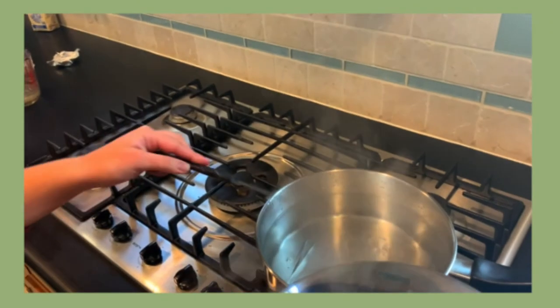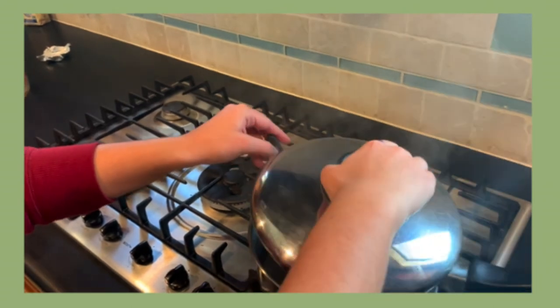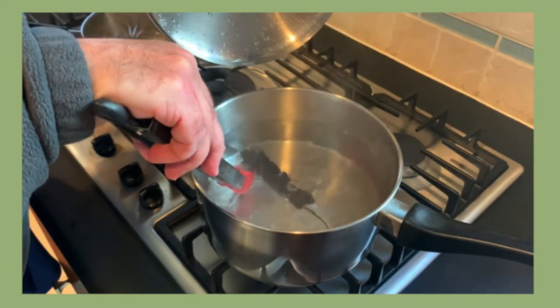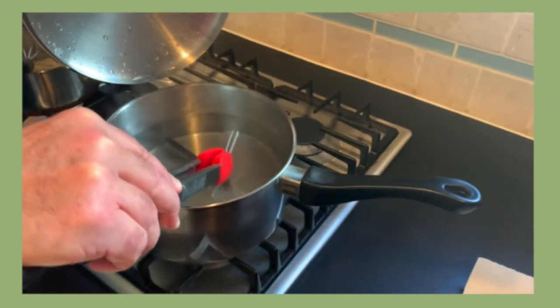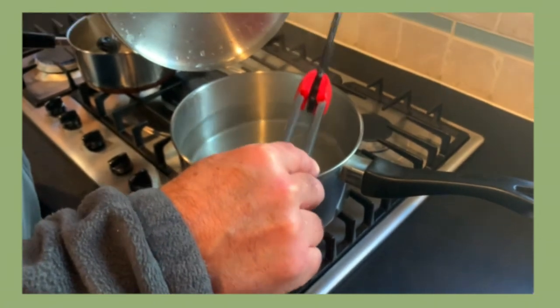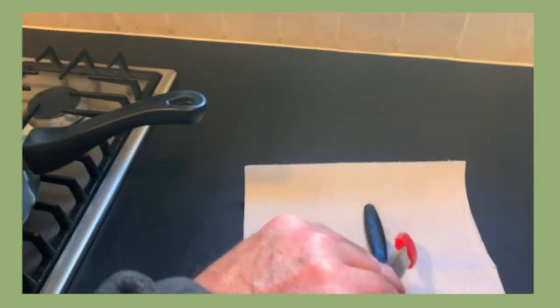Set another pot filled up 3 fourths of the way with water to boil. Place the knife, poker, and tweezers into the water. Let sit for 20 minutes and then remove with tongs. Place all materials onto a paper towel and then cover it with another paper towel to keep clean.